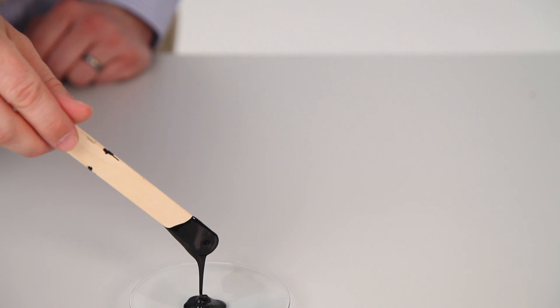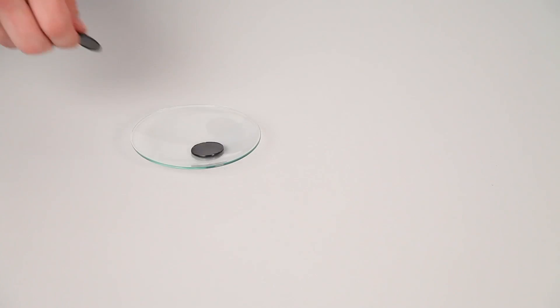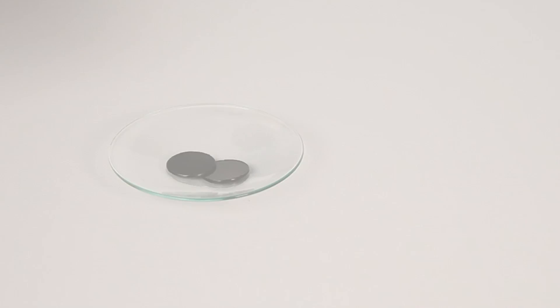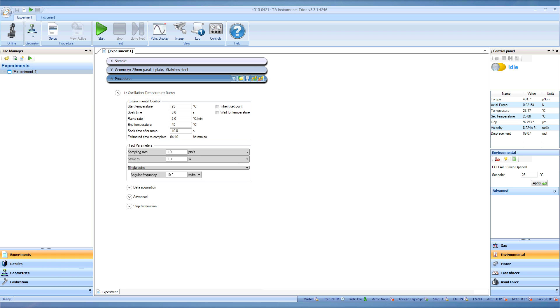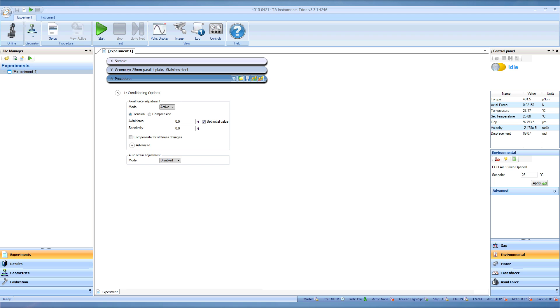To demonstrate, a thermoset material has been selected that has a thick, molasses-like consistency at ambient conditions, but when heated is cured into a moderately stiff solid. As temperature changes or during a cure process, sample volume tends to change and axial force control is required to maintain geometry contact throughout the measurement. Axial force control has been discussed previously, so we will focus here on the Auto Strain functionality, but remember that both functions are typically used concurrently.